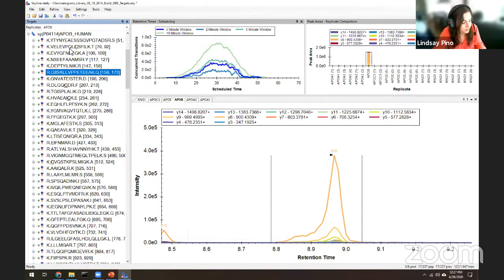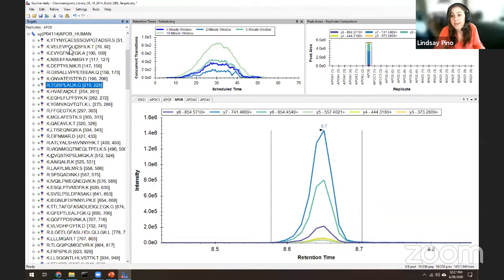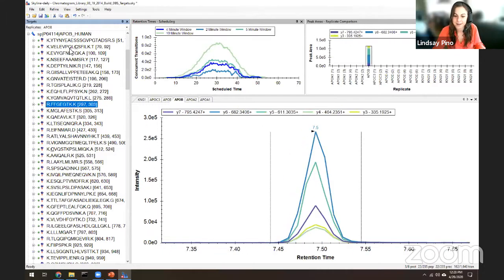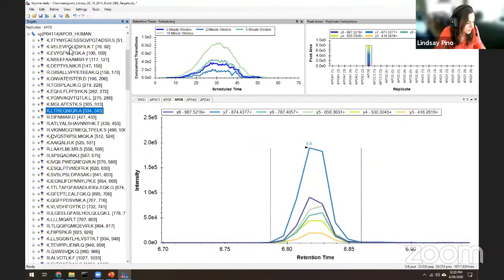In the case of sensitivity, precision, and accuracy, which one is the best, MRM or PRM? I think the literature would tell you that MRM, SRM, triple quadrupole will be more sensitive. But I think PRM, that said, even if a triple quad gives you better sensitivity, for a lot of things, the sensitivity of a PRM is probably good for most things. If you're doing clinical work with patient samples, definitely go chase that sensitivity dragon. But for a lot of biomedical or academic research, I think PRM is perfectly sensitive enough for most of the things we would do.